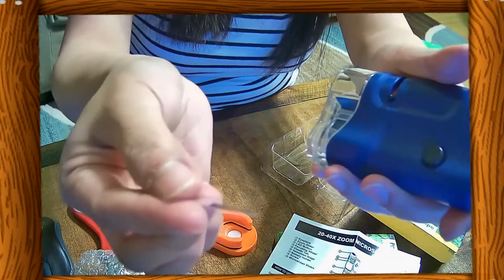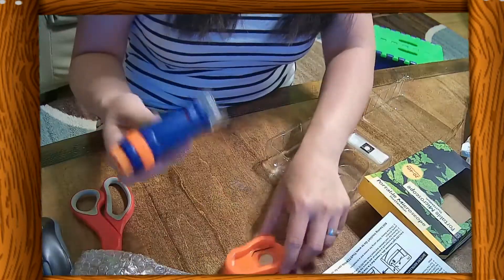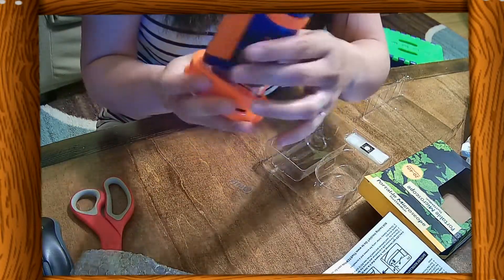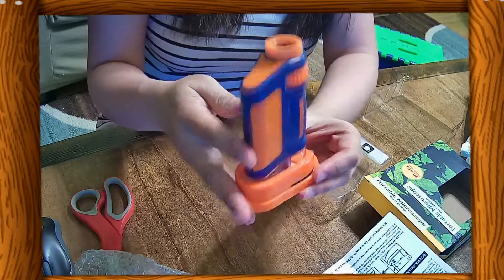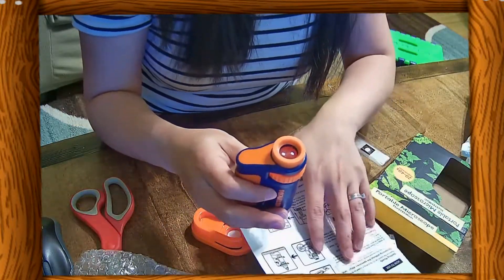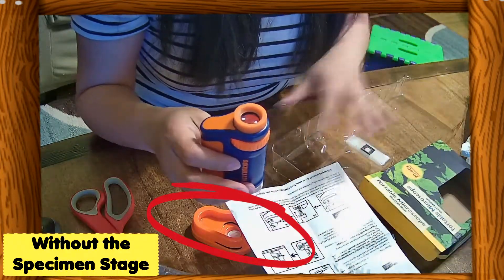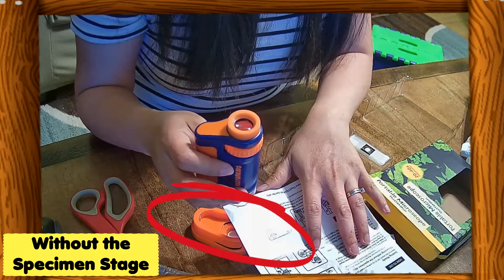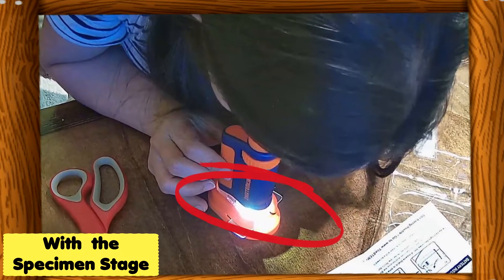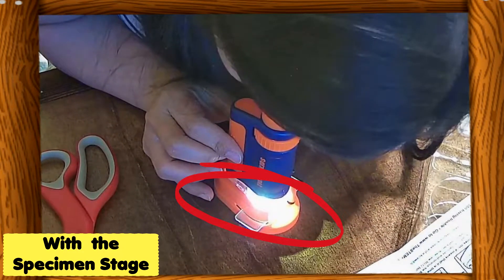Simply remove the plastic tab by pulling it, and now you are ready to use it. But remember, remove glasses before viewing. You can use this microscope without the specimen stage — just place the microscope directly on top of the observation, press the light button, and view through the eyepiece.